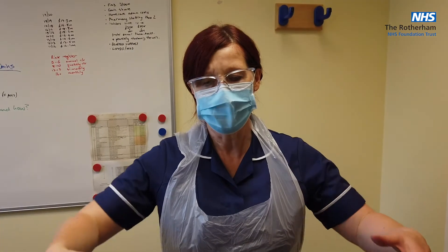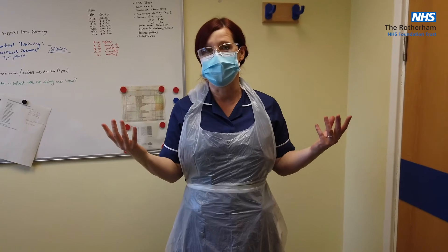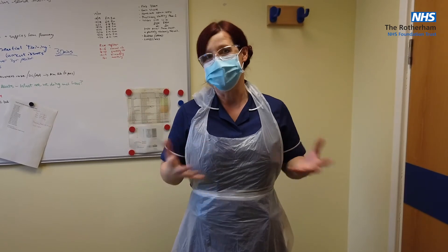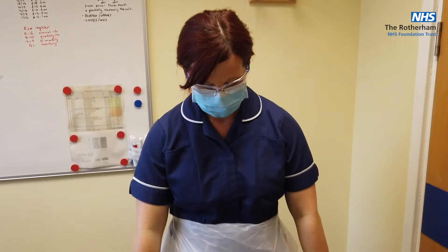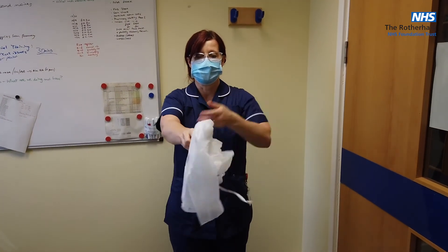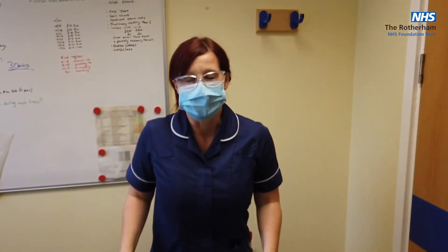Once I've removed my gloves, the next item would be my apron. A lot of staff have the misconception that they should leave their gloves on until the end because they're still protected. But as we highlighted, what we do in our jobs predominantly is by hands and by touching. So by removing our gloves first, we've reduced that risk of cross-contamination. To remove the apron: remove it at the neck, let it drop, remove at the ties and, holding the ties, fold it in on itself. Remembering to fold it in on itself rather than touching the outside, then dispose of it via your appropriate clinical waste stream.